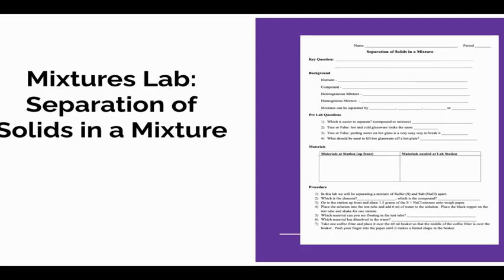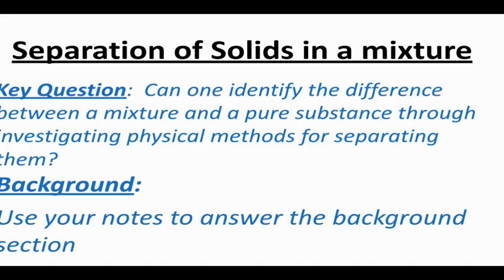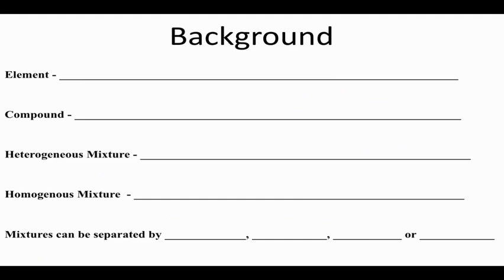Welcome to your Mixtures Lab, separation of solids in a mixture, virtual style. Today's key question is, can one identify the difference between a mixture and a pure substance through investigating physical methods for separating them? We'll be using the background information from our notes to answer our background section.